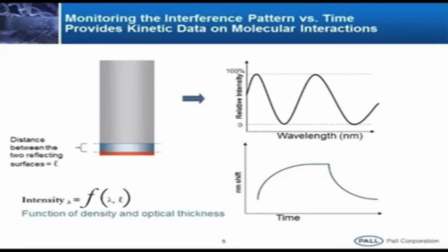Once we bring the same sensor back to the buffer, the molecule bound to the receptor gets washed off. Now, we call this phase the dissociation phase. So, dissociation divided by association we call the affinity.